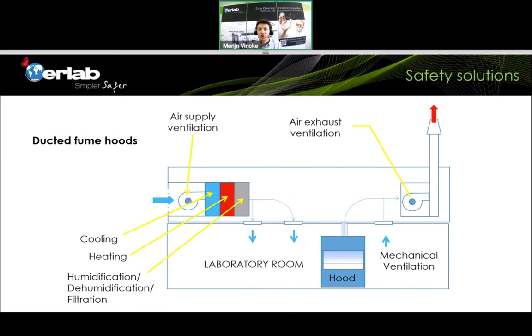So that's also important to take into account, and it's also an awareness that people need to have when choosing the adapted safety equipment. Of course, the risk in the lab is not completely gone when you use ducted fume hoods. You will exhaust the air to the outside, but then you have to pull clean air back into the laboratory through an HVAC system, and that air will be heated again or cooled again, which will result as well in a high energy cost.